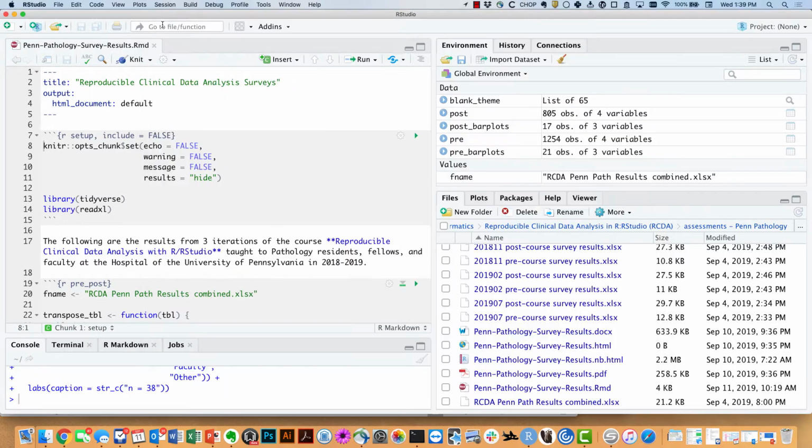So a computational document contains embedded code, and because it does, it can automatically reproduce an analysis. And not only can we reproduce the analysis, as Amrom had explained earlier, we can reproduce the analysis automatically. And that automation creates opportunities for labs and pathology departments to create not just ad hoc reports, but also repeated automated audits and fully automated dashboards even.